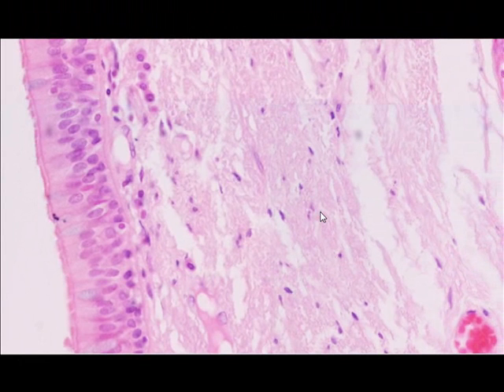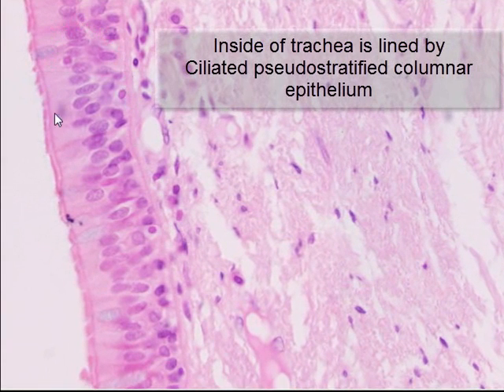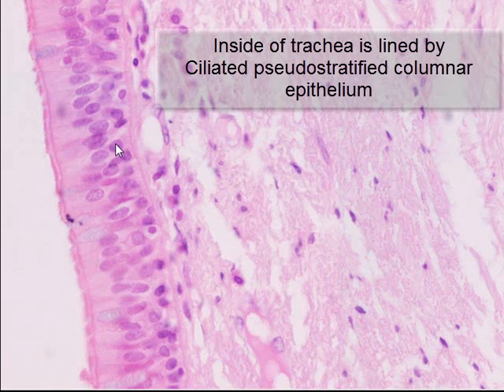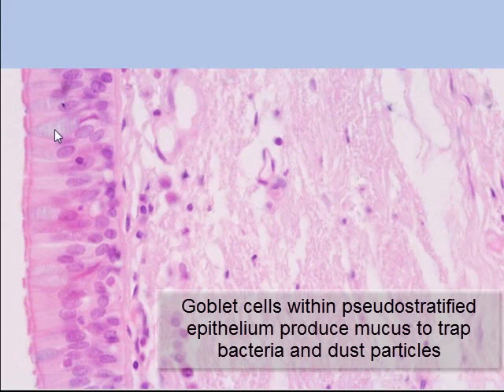The sample under the microscope is from the trachea, which is lined by ciliated pseudostratified columnar epithelium. This is the lumen of the trachea, and the inner lining is made up of ciliated pseudostratified columnar epithelium, which also has numerous mucus-producing goblet cells. These goblet cells produce mucus.